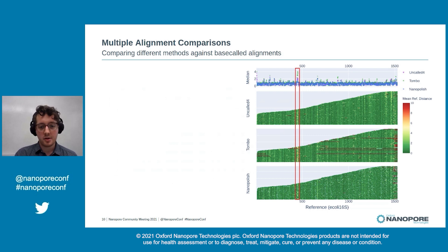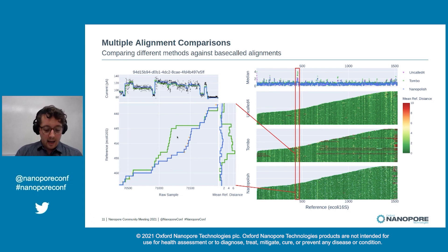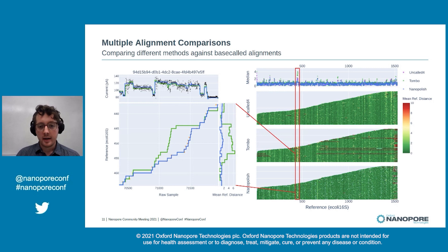Another thing that stands out is a position around 500, where all methods seem to be having trouble to varying degrees. Looking closer at an alignment around this region for Nanopolish and Tombo, Nanopolish is quite close to the base-called alignment while Tombo is a bit further away. We're still exploring exactly why this is happening. The signal is quite noisy in this region, and sometimes the signal gets noisy and we're not sure why. Our plan is to do a wider screen to find other examples and look for sequence motifs — such as low complexity sequence or evidence of secondary structure on the trans side of the pore.